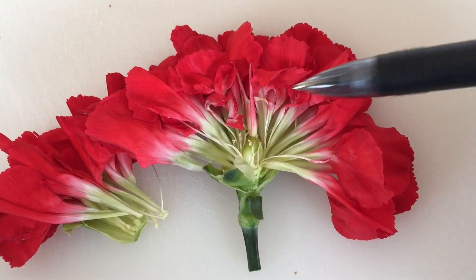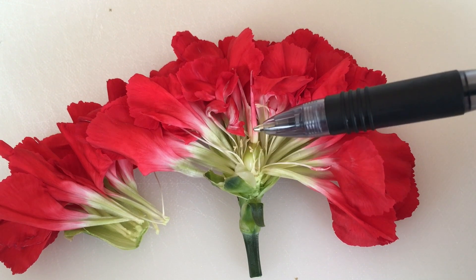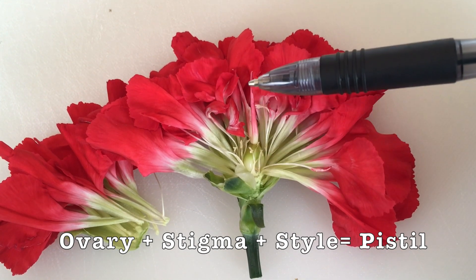If I'm looking at this flower, we're going to start with the female reproductive organs. Here at the bottom, this circle is the ovary. The stigma and style make up the rest of the pistil, so this entire portion right here is the pistil.